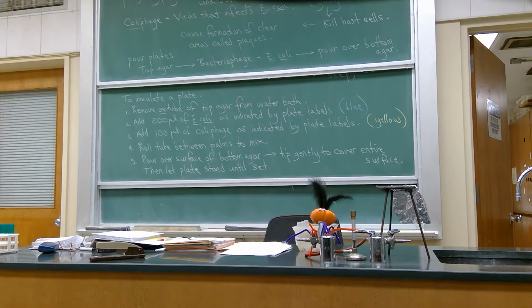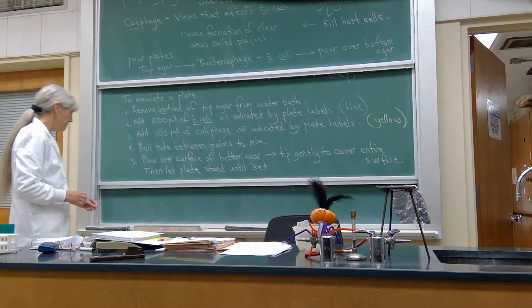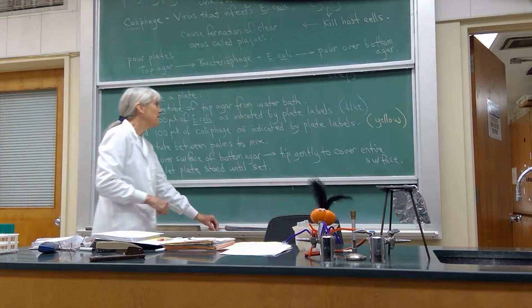Should you have your Bunsen burners going? Yes, because it all has to be done aseptically. You do not want to introduce a bunch of things that would grow on there other than E. coli. So yes, aseptic technique matters.